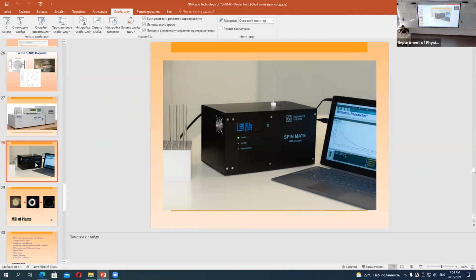Well, it depends on the type of application of human MRI, because sometimes you don't need high resolution in your picture, you just need to detect some pathological things. That's why 0.5 Tesla is a classical MRI machine that was really popular in recent years. Now things are changing to 1.5 Tesla, but 0.5 Tesla is not the low field MRI.